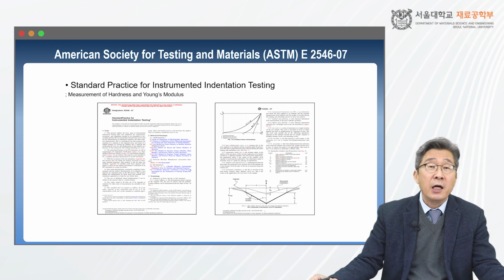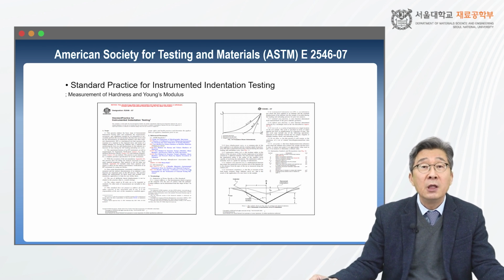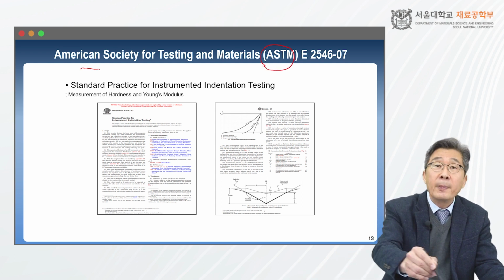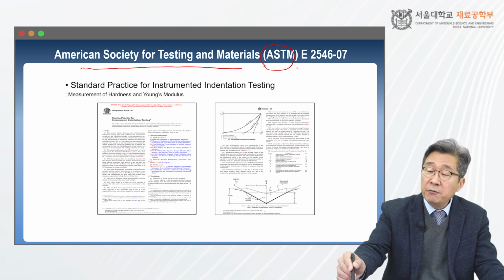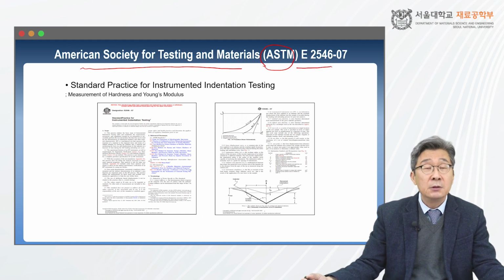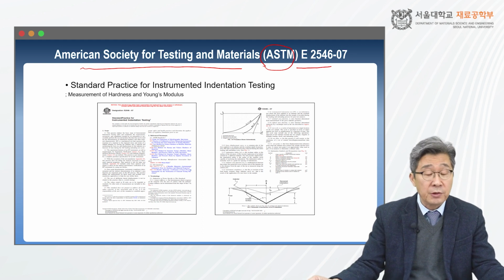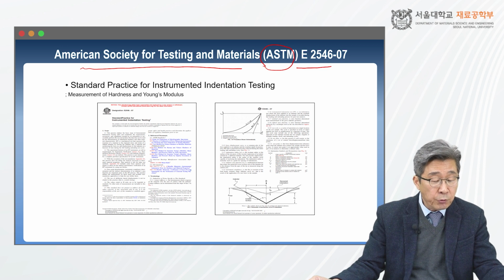If you would like more information on indentation testing procedures, you can refer to ASTM E2546-07. The title is Standard Practice for Instrumented Indentation Testing, in which instrumented indentation testing is defined as a mechanical test that measures the response of a material to the force and displacement of a sharp indenter.